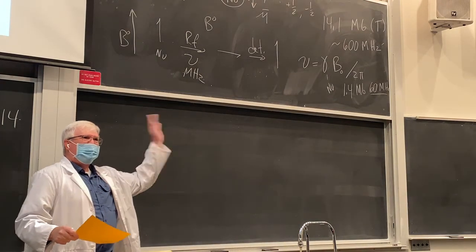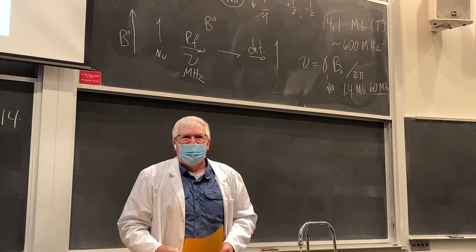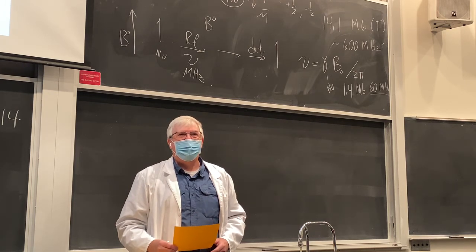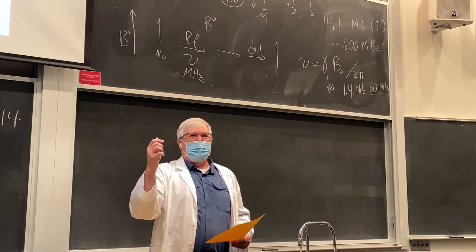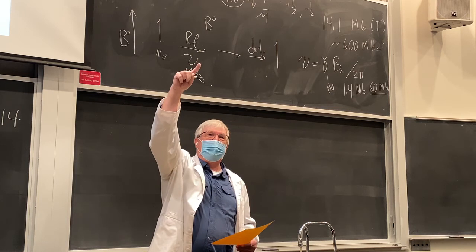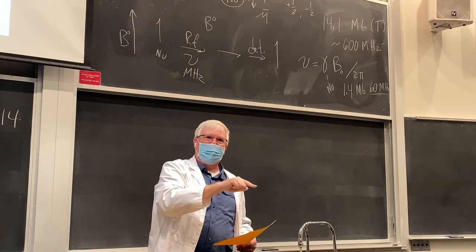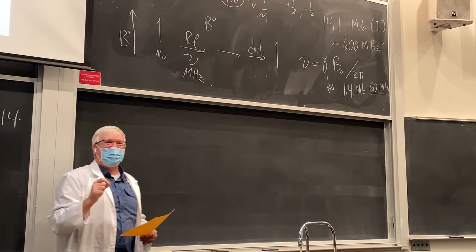The basics of the instrument, you have the idea of what's going on electronically, at least with it. I saw a couple hands, yeah. So the instrument is measuring when it goes from vertical to horizontal back to vertical. Yep. So the question was, what's the instrument actually measuring? It's the spins coming back into resonance with the external magnetic field. So you see at what point the molecule's absorbing the radiation. Okay, so that's what the peak goes up. It's absorbing radiation right there. It's being tipped out of resonance with the field, and then you see it come back in, and that's the back part of the peak as it decays back in to resonance. Yeah, so it's a lot of very sensitive electronics, but that's exactly what's happening.